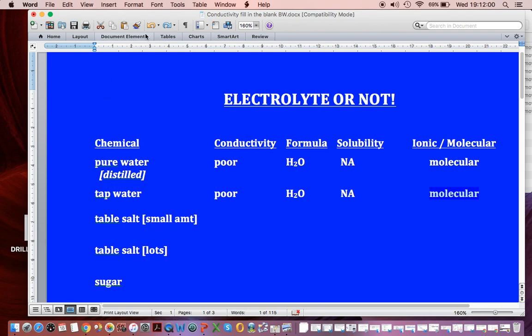Now we start with a small amount of table salt. And it's pretty good. We know it's NaCl. We know that dissolves. It's soluble. And we know it's ionic.